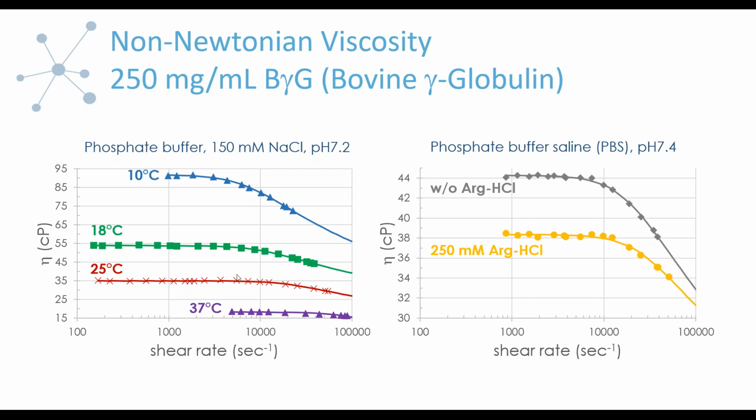So back to the temperature variation. What we're seeing here, we can interpret in a very general way, and you can stop there, or ideally you'd want to proceed with the analysis that we're going to do. But let's just make the general observations first. As we reduce temperature, we increase viscosity.